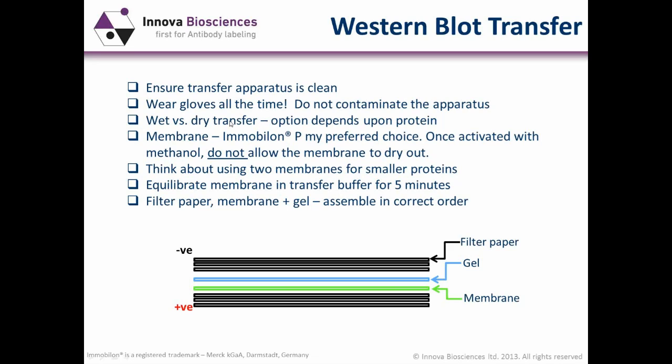So after spending the night running the gel slowly, I would come in the morning and set up a wet transfer system, running it at a low voltage throughout the day, at least 8 hours. This ensured that I got efficient transfer of my large protein from the gel onto the membrane itself.